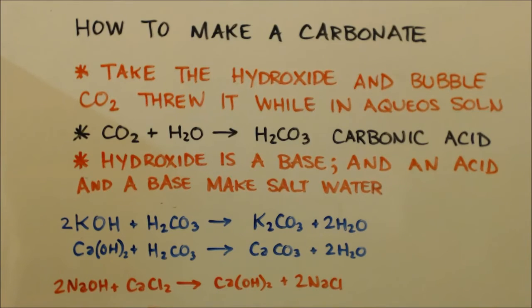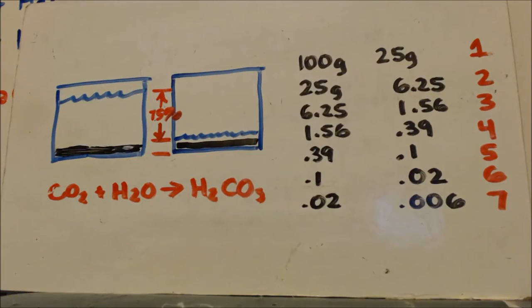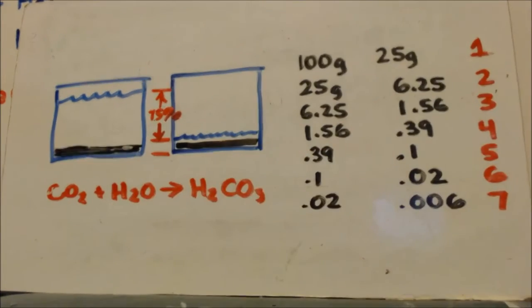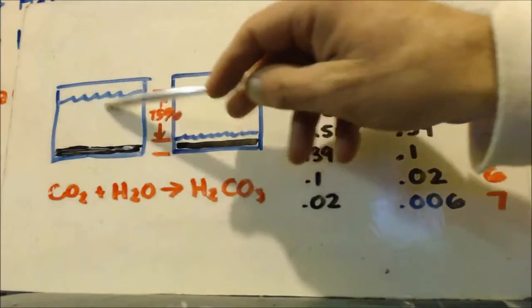And the way I make it is to mix it with sodium hydroxide, because most hydroxides are insoluble except for potassium and sodium. So I mix them together. This precipitates out as my hydroxide, but there's impurities. The salt, because you're going to have sodium chloride now. So I need to get rid of the sodium chloride, right? Okay, so what I do is I put it in a bigger container. I just mix those two together. Here's my precip down at the bottom, my hydroxide I just made. And I fill that container all the way up, a big container, with water.